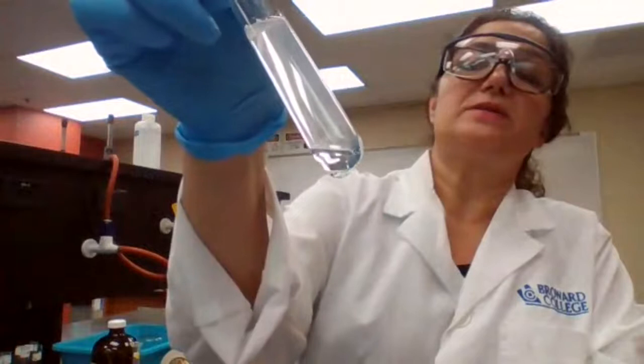Okay. Okay. We have the 0.2 left. It's at 900. A long way to go. We have a big piece of magnesium still there to dissolve. So I might leave it alone.